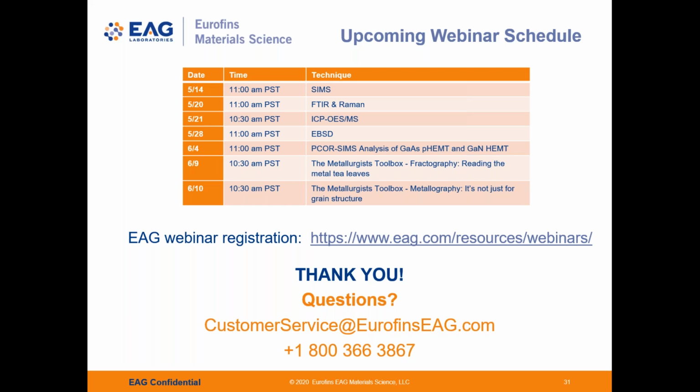What is the depth resolution of RBS? The depth resolution is about 5 nanometers. It will vary, of course, with the structure of the film or film stack. If it's a film stack and there are overlaps, I would say the depth resolution would increase to somewhat more, 10 to 15 nanometers or so. I showed a slide in which the film is very thin, 50 angstroms. That is probably about the limit of depth resolution of the technique.